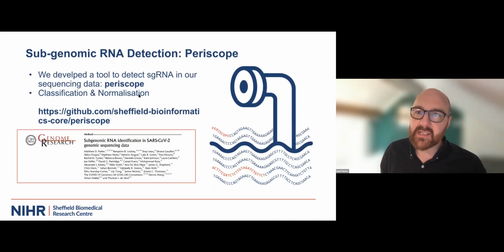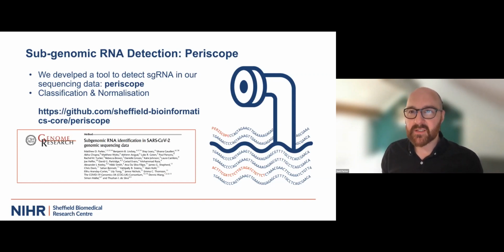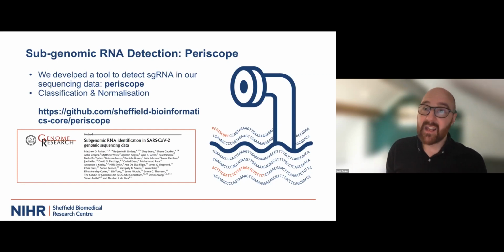But we also do some normalization. And so it's important that we normalize the levels of subgenomic RNA that we're seeing to the amount of sequencing data we're producing. So you can do it several ways. And we found the best way actually was to normalize our data to the number of reads resulting from that amplicon, because we want to try and control for amplification efficiency some way, because obviously some amplicons produce better data than others in these protocols. And so we wanted to make sure that our subgenomic RNA was the best representation of that abundance that we could from the data that we have.